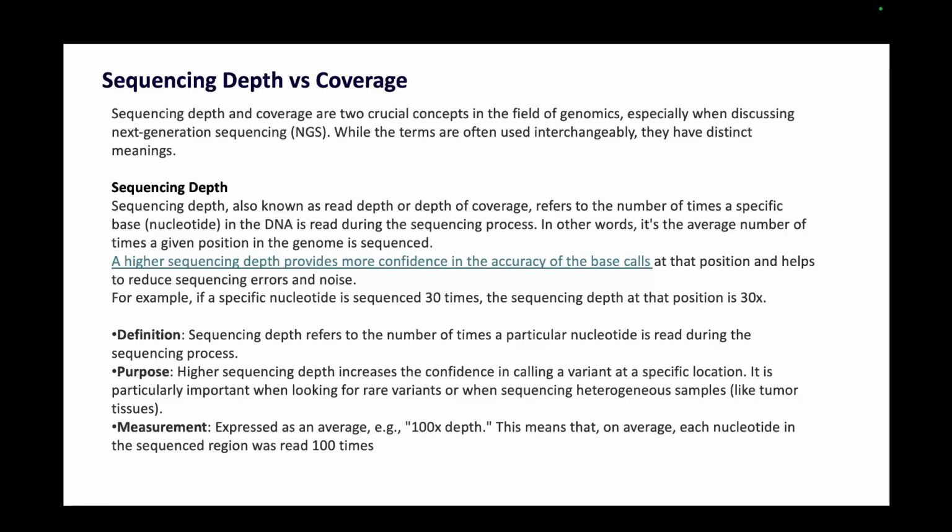So sequencing depth is also known as read depth or depth of coverage. You'll find a lot of terms out there, but what it actually means is the number of times a particular nucleotide or a particular base in the DNA is read during the sequencing process.